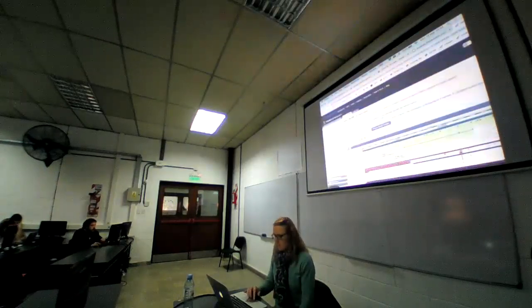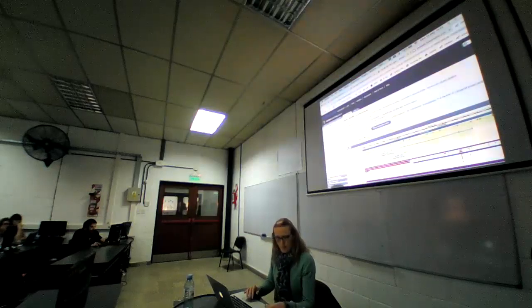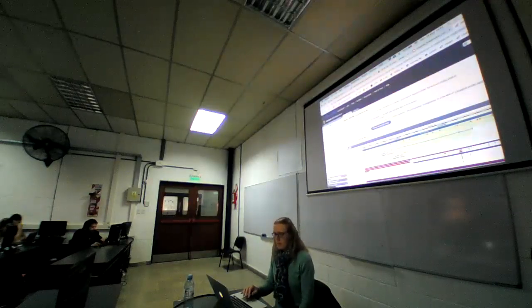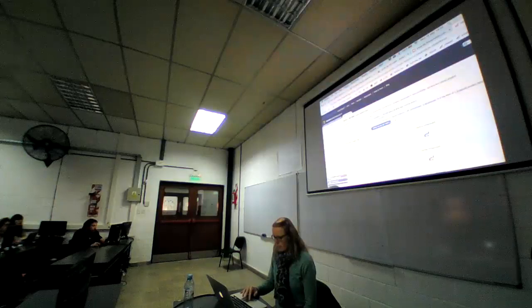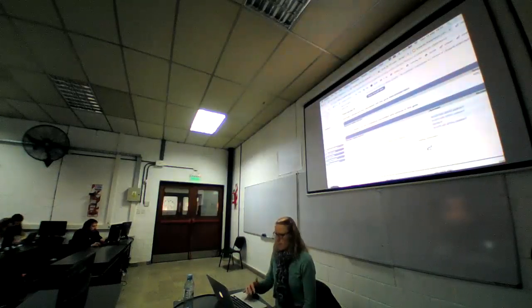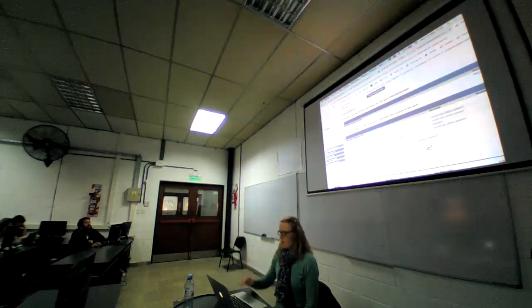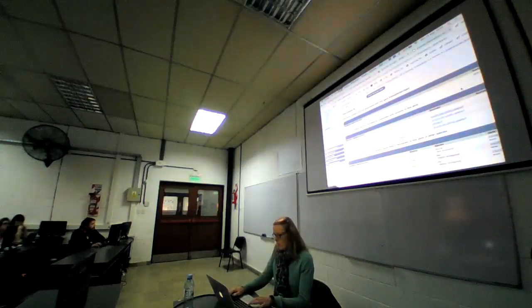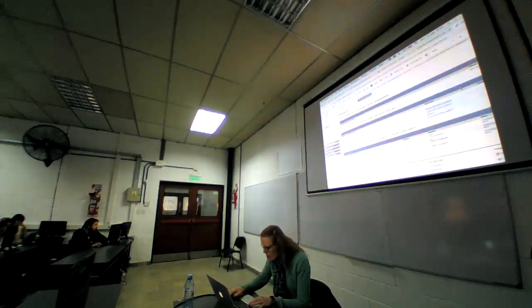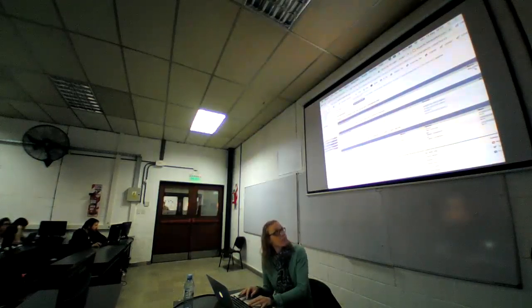Okay, so that's the gene and the transcript tab, the gene tab. I would like to show you the phenotypes as well. So here, just above the genetic variation, you have the phenotype page on the gene tab. And that has 3 tables. The first one summarizes phenotypes, diseases, and traits associated with the gene you are looking at. Here it's lactose intolerance, and that association comes from MIM morbid, as you can see here on the right hand side.